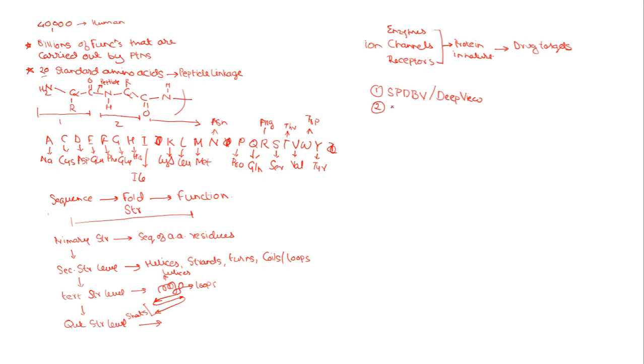People might use Chimera, or they can use VMD for doing the same stuff. If you are working at a very elementary level, even RASMOL is very handy, but I have selected Deep View for most of the practicals because it is quite visual.